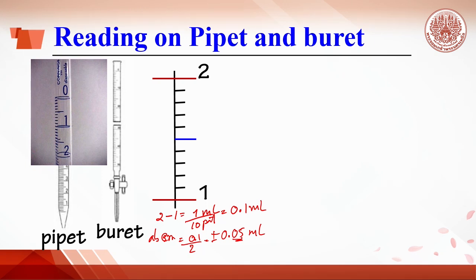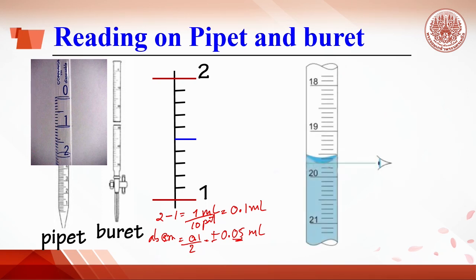It is important to make sure your eyes are at the same level as the meniscus to obtain an accurate reading. A lower or higher eye position will result in reading errors.